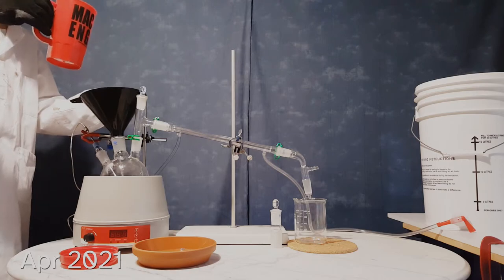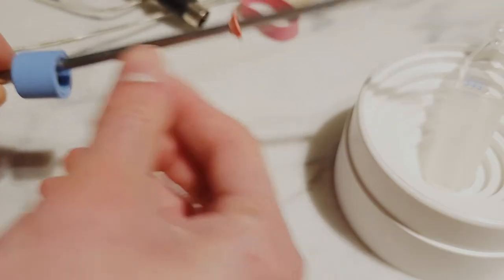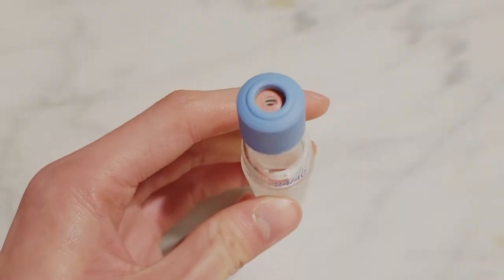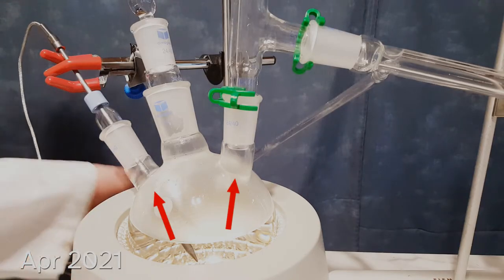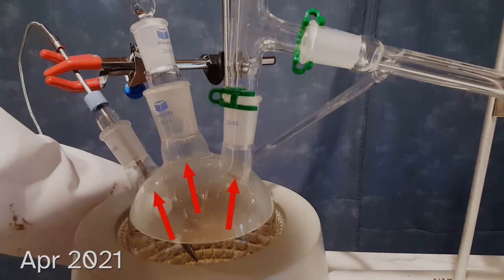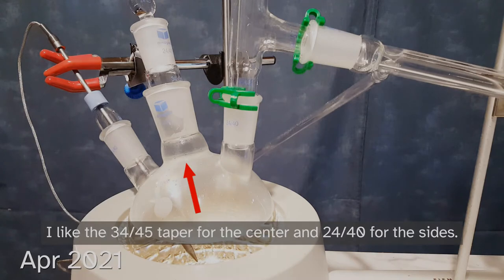The temperature probe is fitted to the flask using a thermometer adapter I modified with a piece of rubber band to keep everything airtight. One thing I really like about using three-necked flasks like this is that you have two ports for connections and still have one for direct access to the contents. I usually keep the center neck a larger diameter just to make adding and removing stuff easier.